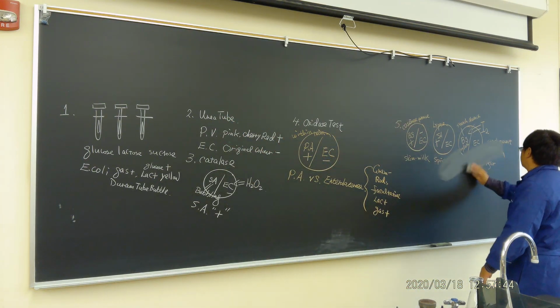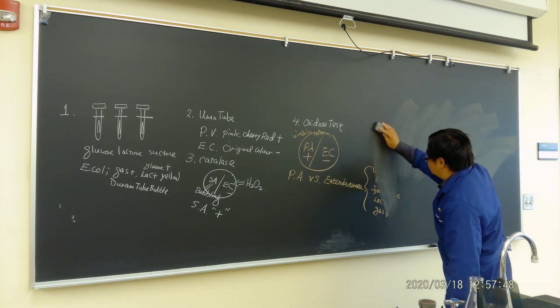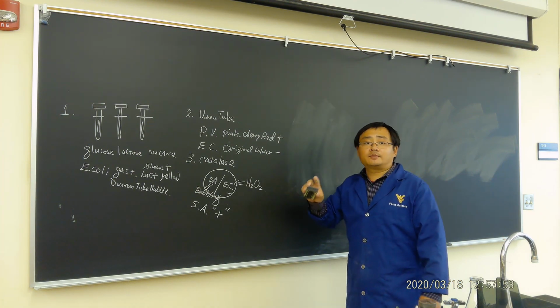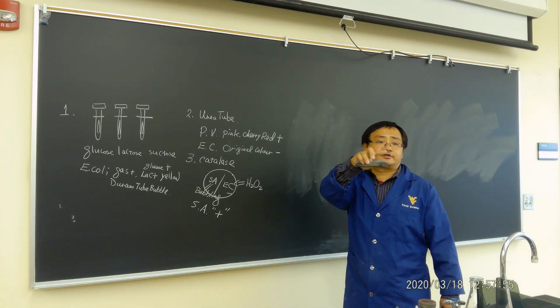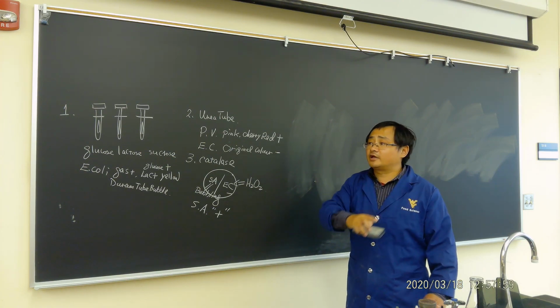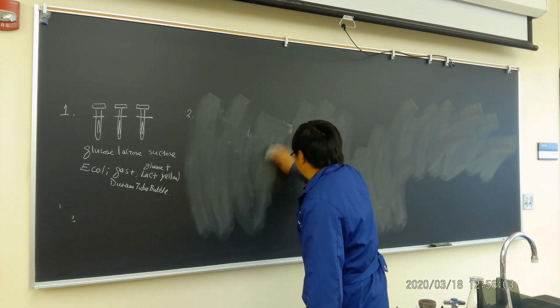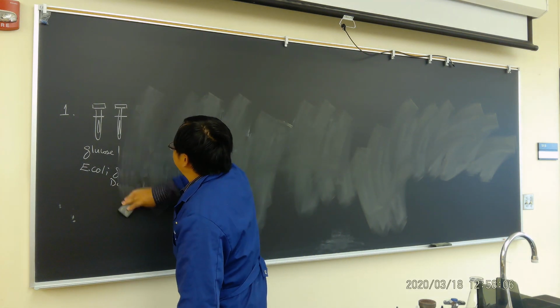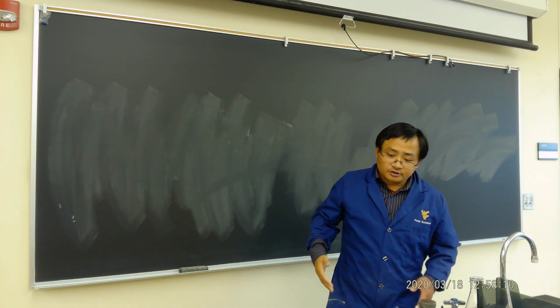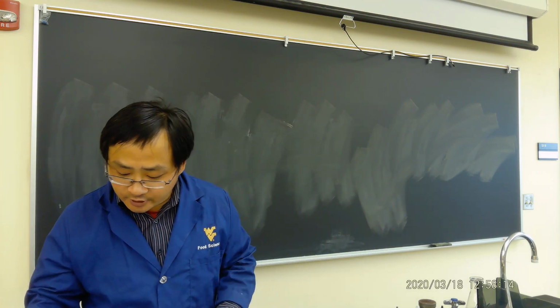We're going to still continue to do 3 tests today, including 1 Enterotube test. Let me see how many we have. 1, 2, 3, 4, 5, 6, 7, 8, 9, 10, 11, 12, 13. We have 13. Maybe everybody can use one. I have 25 for 1 box. I assume the second lab will be 8. We'll see. We maybe just do a pair, okay, for the Enterotube test.